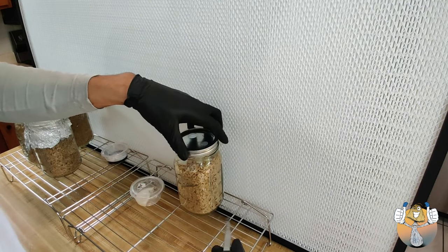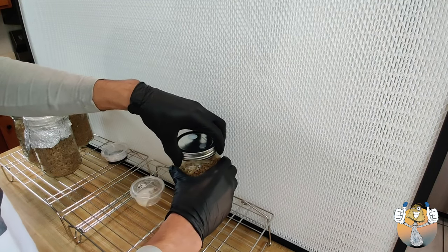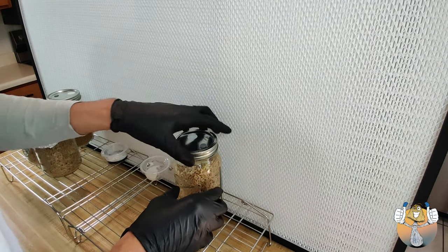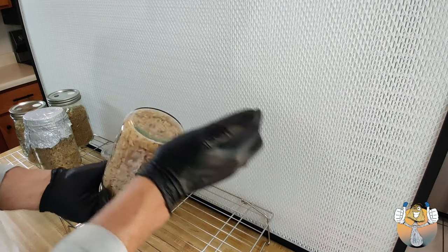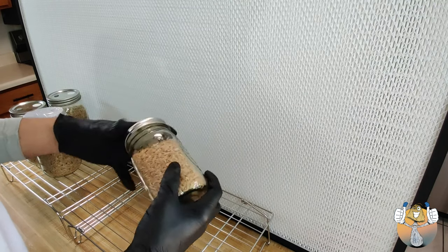To be honest, if I wasn't working in front of the flow hood, I would more than likely sterilize my scalpel after every two cuts that I make, just because I wouldn't have that extra security of working in the sterile environment. Yeah, I'm hyped that I got out of that still air box.